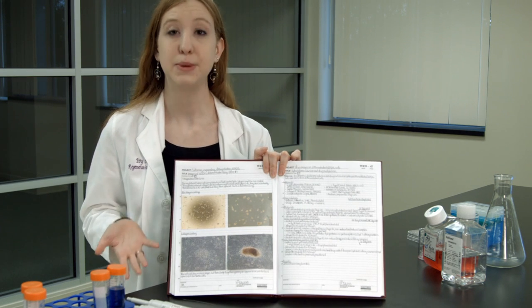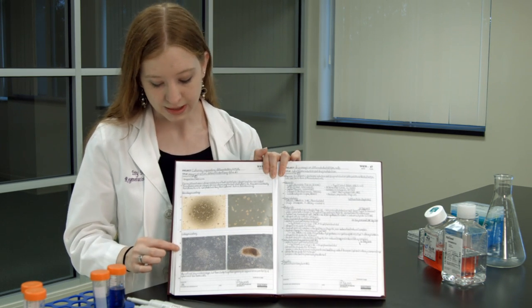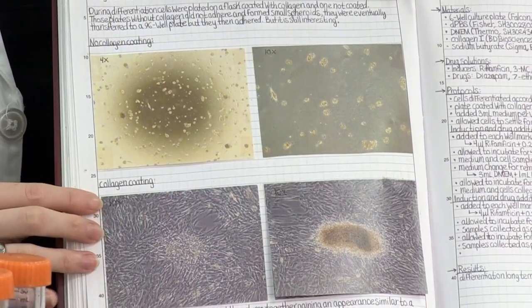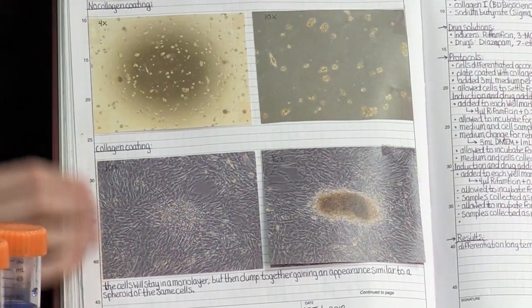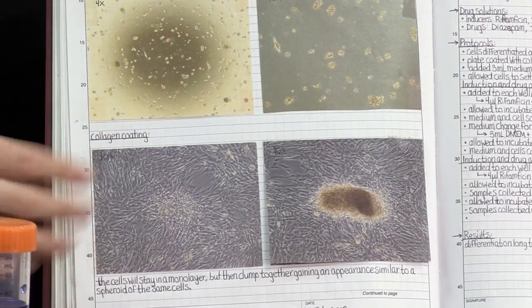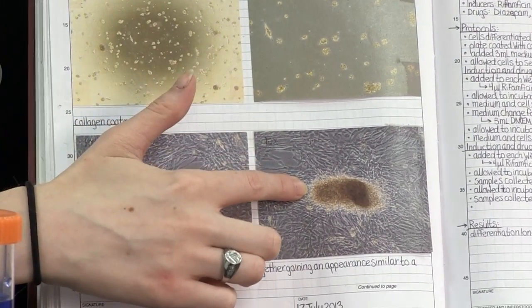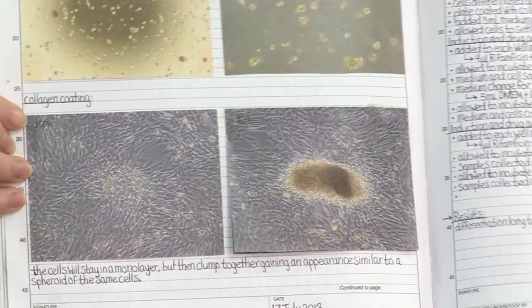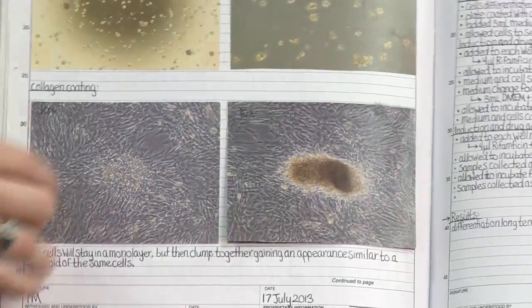It can be really helpful to be able to look back on that. For instance, on one day, these cells were growing in a monolayer and they had a very spindle-shaped morphology. And seven days later, they formed this giant structure, this blob shape. So that was really helpful for me to look back and say, oh yeah, these cells have definitely changed over time.